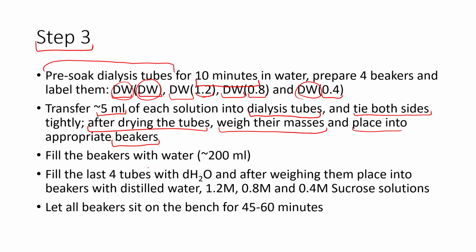Okay, so what we do next, we fill the beakers with water. So this is distilled water, and we bring to the volume of 200 milliliters. So lastly, we prepare the tubes with distilled water only, and after weighing these tubes, we place them into our solutions, so the sucrose solutions, into each of them. And after that we leave it on the bench for 45 to 60 minutes.